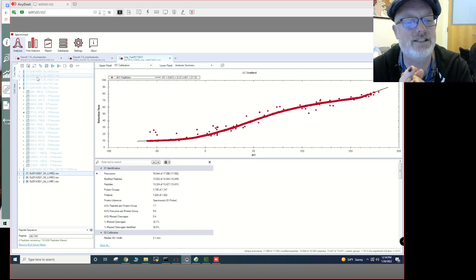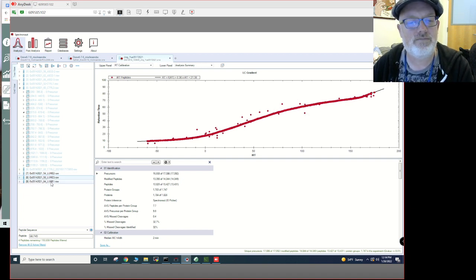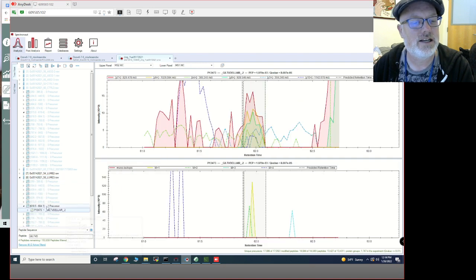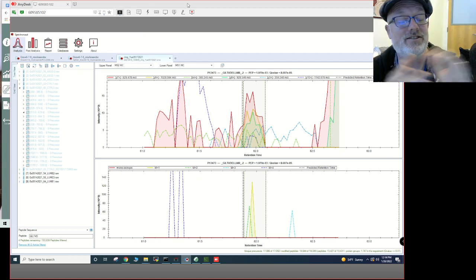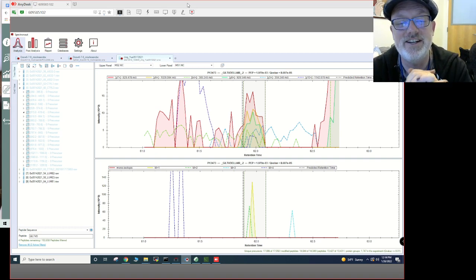Okay, anyway, thanks again. Sorry this took a little long, but I'm going to try to have shorter videos. I'm hopefully going to publish this online once the paper gets accepted. Hopefully it'll get accepted. I think this is pretty good evidence that these proteins are only in the LUME samples and not in the control. And if you don't believe me, you can download the data and follow my videos and see if you could come up with something different. But that's my analysis.